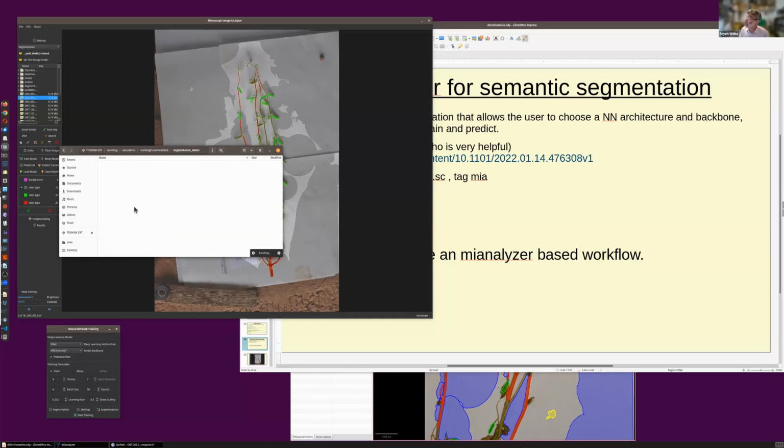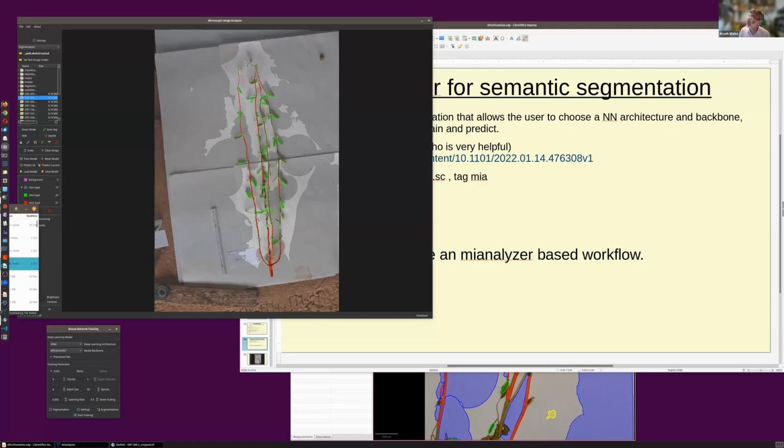If you look at segmentation labels, you see a bunch of files in here that end with NPZ, and it's not important if you can read the file names or not. Every one of those NPZ files corresponds to an image file here with the same name. And one of the lessons here is that for every one of these programs or packages, you need to know where it wants to find the data and then set it up accordingly.